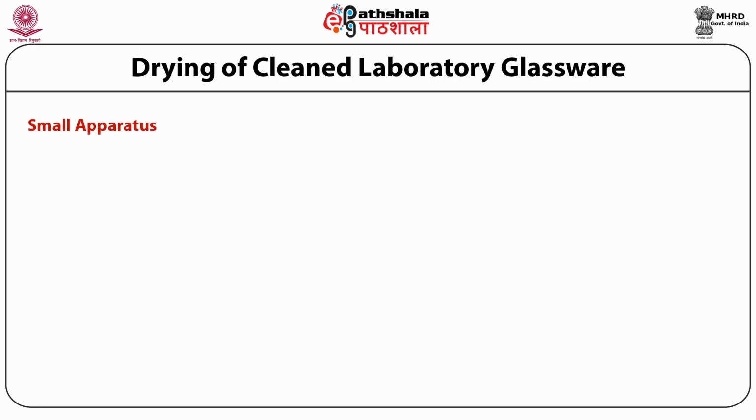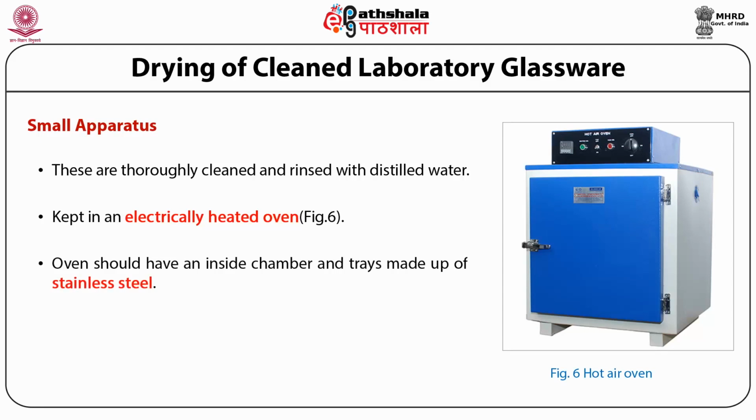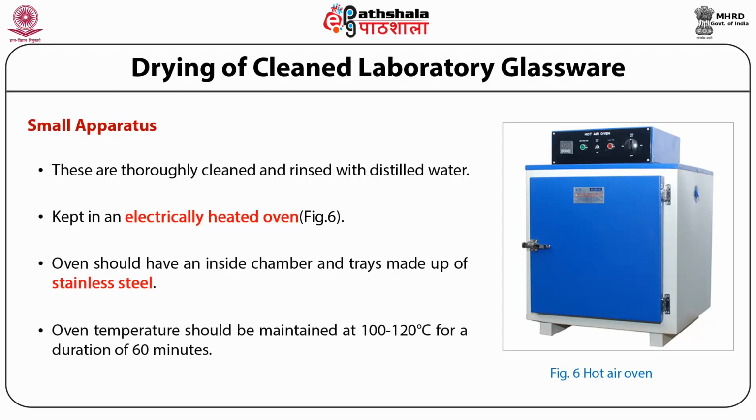Small glass apparatus. These are thoroughly cleaned and rinsed with distilled water and kept in an electrically heated oven, preferably having an inside chamber and trays made up of stainless steel, previously maintained at 100 to 120 degrees centigrade for a duration of 60 minutes.